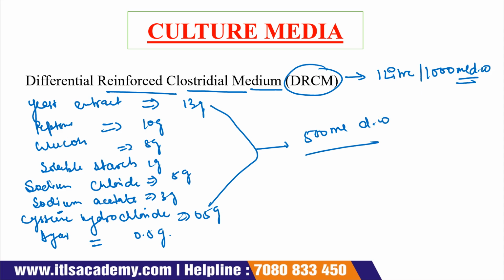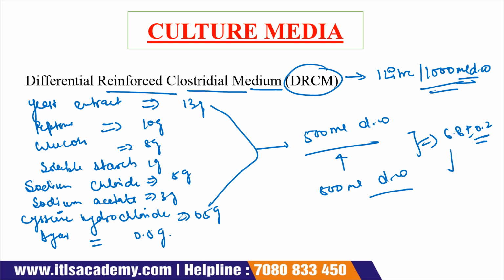When it is completely dissolved, the remaining 500 ml of distilled water is added to make up the volume to 1000 ml. After that, we have to maintain its pH at 6.8 plus minus 0.2. Then we autoclave.